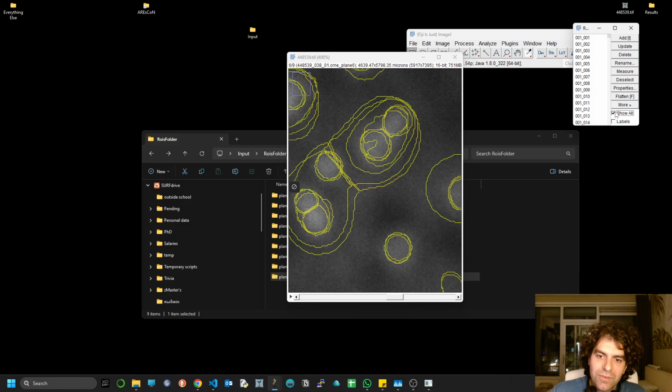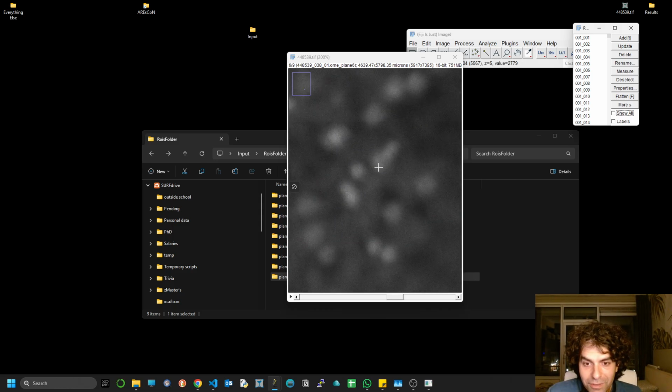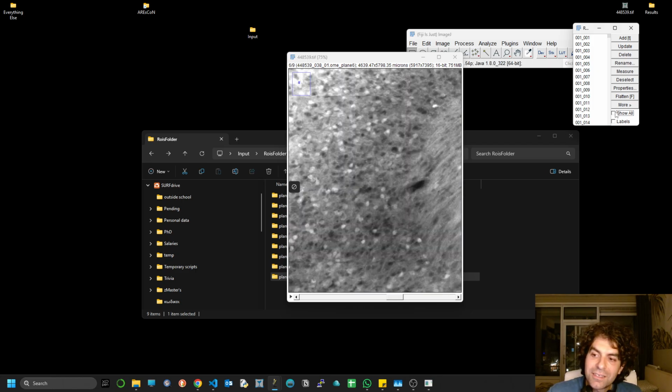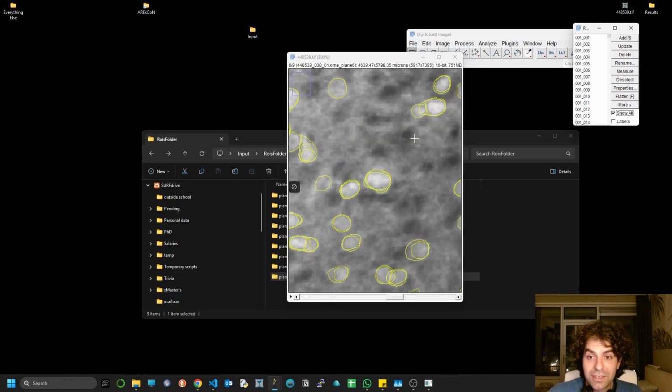So the observation that you see there is actually an observation that comes when you have that particular plane. And there's nothing valuable in that particular plane for this part, but there might be for other parts. And this is the reason that you need to apply the filtering, right? You don't want double rows or triple rows or even worse. And that's why we're going to do the Z filtering later, and for that we need these find edges.